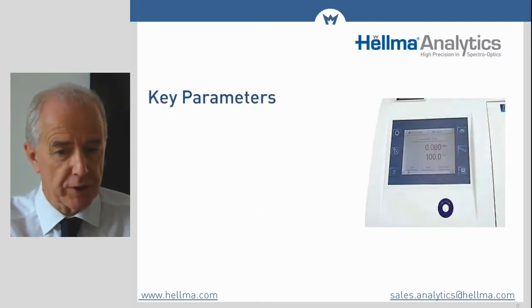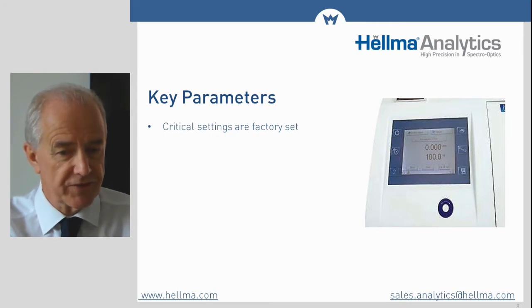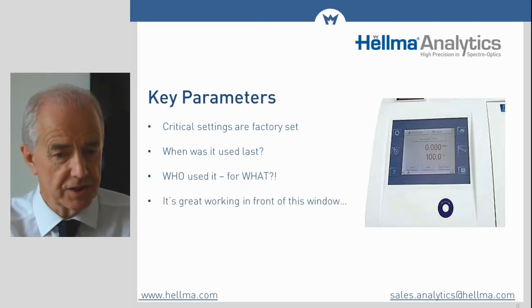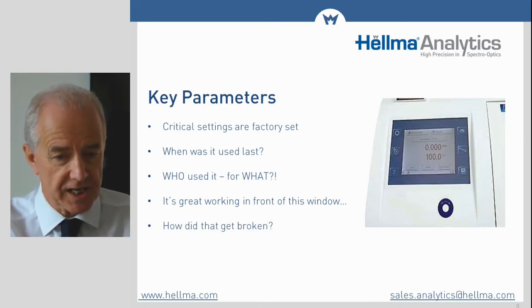Unlike many laboratory and process instruments, spectrometers require little pre-calibration before use. Most of their settings are fixed in manufacture, and typically all that is needed is a blank to take out any baseline offset. But time, usage, operating conditions and accidental damage can degrade these fixed settings and will impact on the spectrometer's performance and the accuracy of your results.